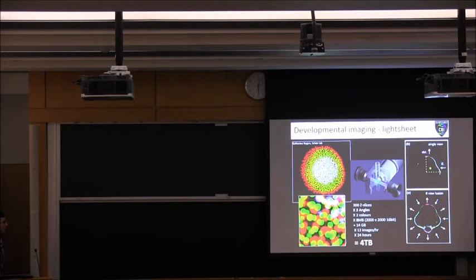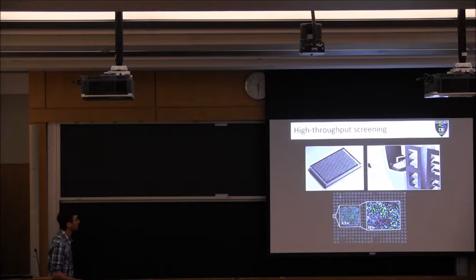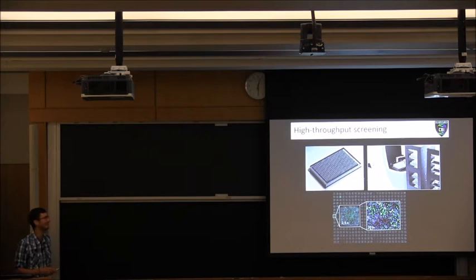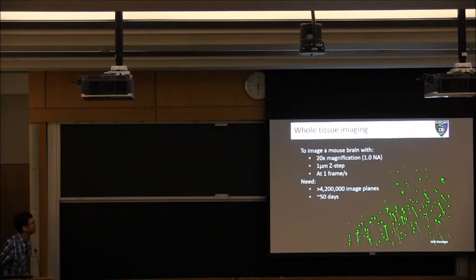And now with our Cell Discoverer, where we're able to take these multi-well plates, I think this is a 384-well plate. You can go higher than that. You can stack about 20 of them in the robot and load them one at a time. I don't even know what number that gets to. Thankfully, no one's tried that yet. But the four color imaging on a high res camera, I don't even want to know what that number is. So there's a whole bunch of different ways to get to this big data problem.